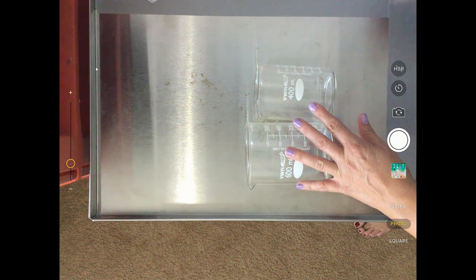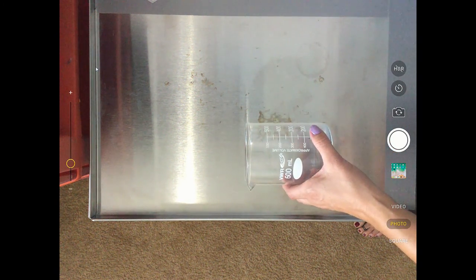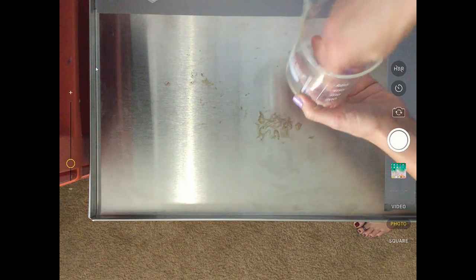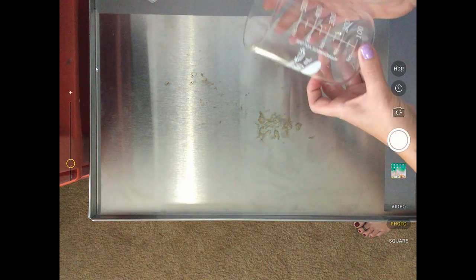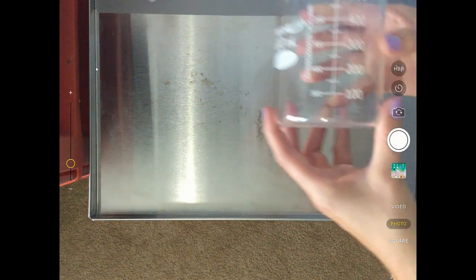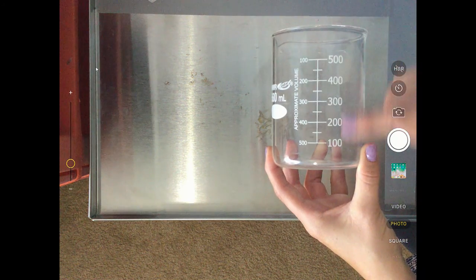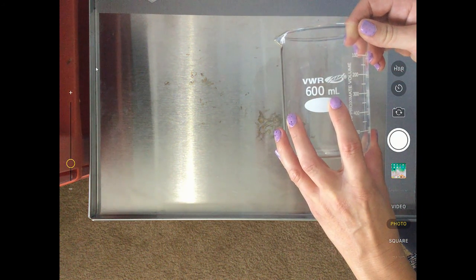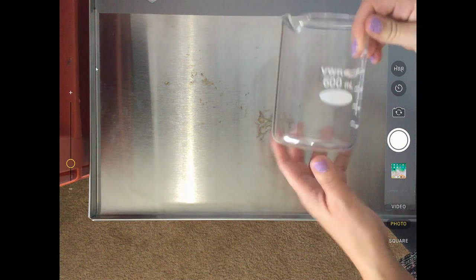Beakers are what we use to record volume. This is how we measure volume. Volume is how much space inside of a three-dimensional figure an object can hold. In this particular situation, the beakers are already graduated down the side with measurements, and the total volume or capacity of this one is 600 milliliters.